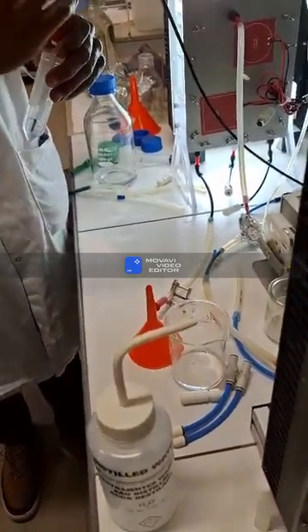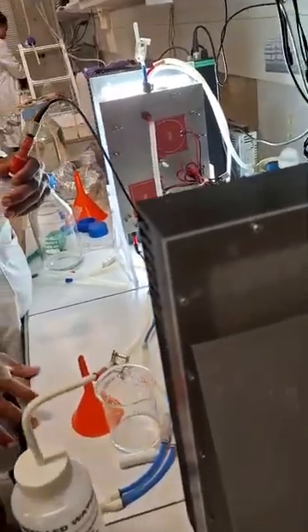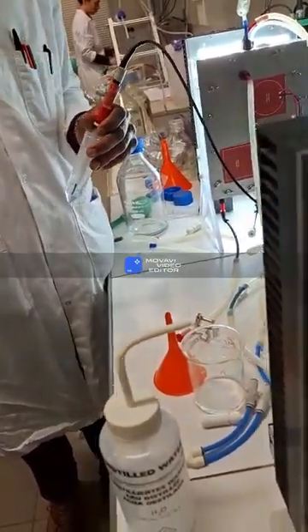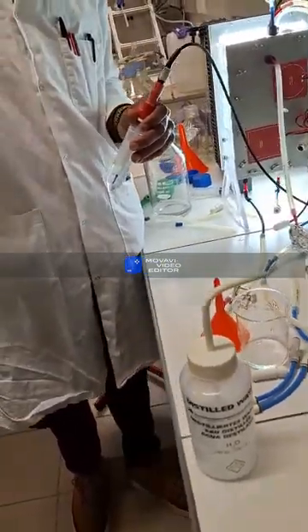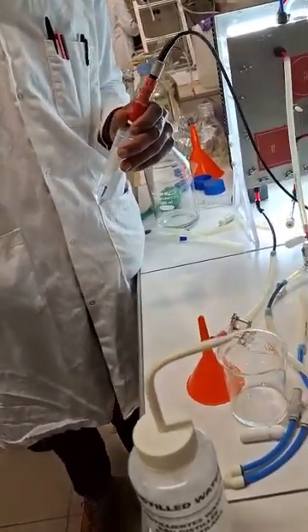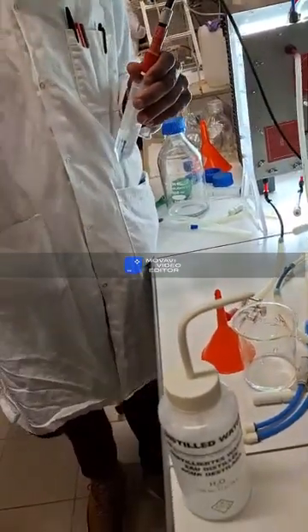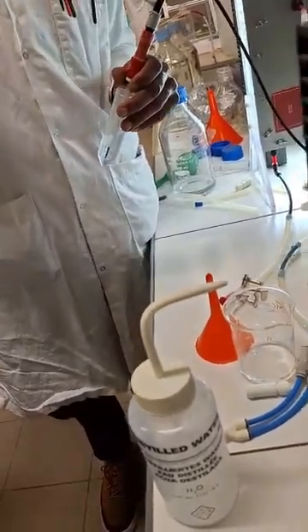And during the photosynthesis process, you have the production of O2, the oxygen. So the oxygen will basify the solution. So you will go to, for example, 10 of pH if you don't have a regulation. And the O2 will be toxic, and the increasing of pH will be toxic for the cells in the culture. So this is why you have to regulate by the pH, and also you have to bring carbon source for your culture. And it will be possible to combine both.